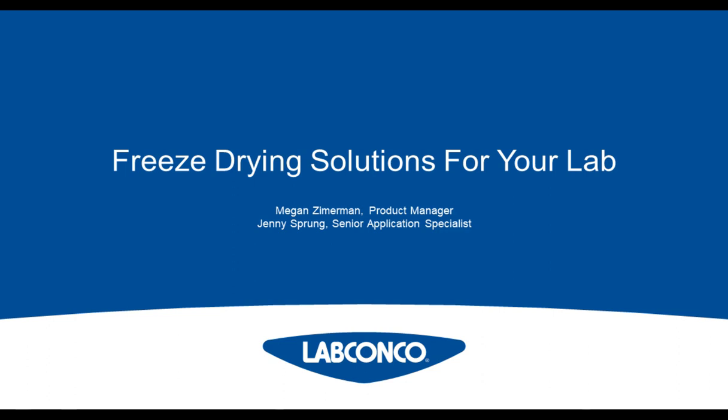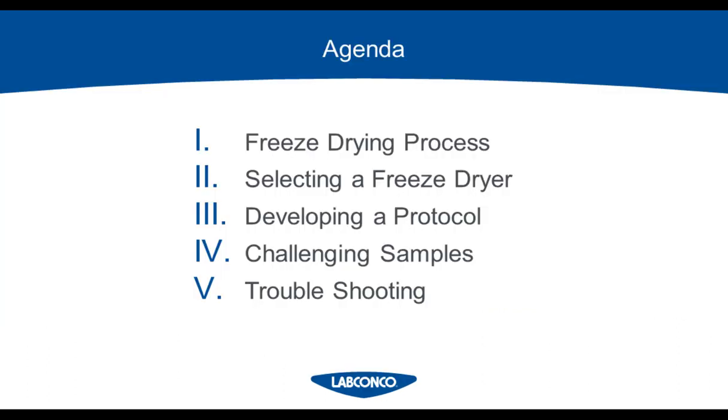Thank you, Michelle, and thank you to everyone for joining us. Today we'll be talking about freeze-drying solutions for your lab. We'll start by discussing a general overview of the freeze-drying process, followed by how to select a freeze dryer to meet your needs. Then I'll pass things off to Jenny, and she'll talk about how to develop a protocol, freeze-drying challenging samples, and troubleshooting.